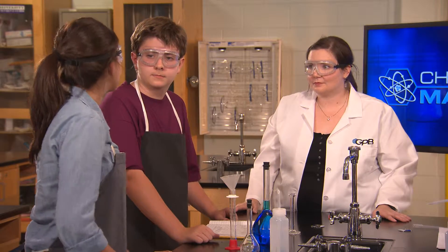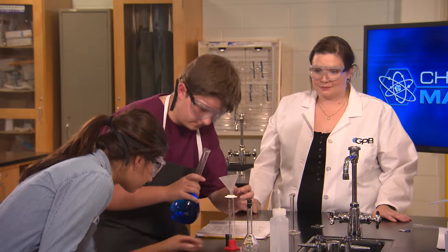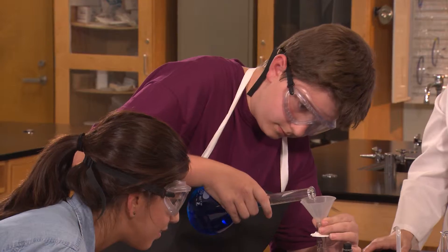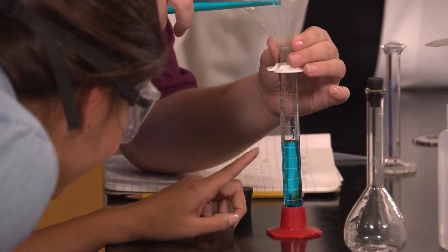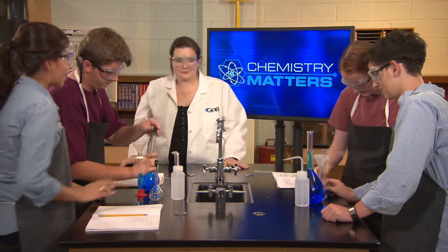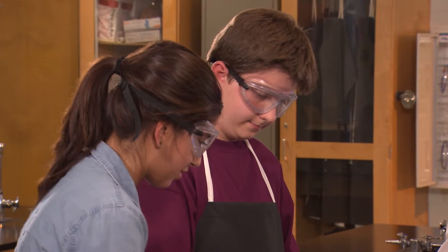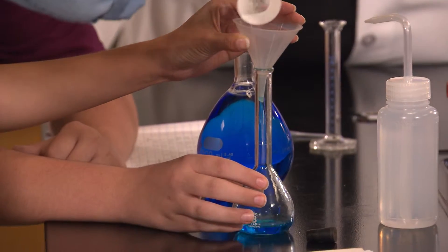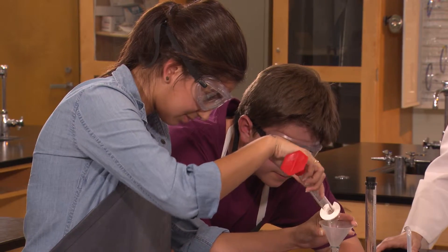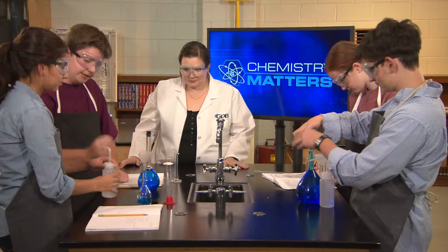Let's add the copper(II) nitrate solution to the 25 milliliter graduated cylinder. Be careful not to overshoot it—let's put about 16 milliliters in. Once we have the right amount, we'll pour it into the 100 milliliter volumetric flask. Now let's add the distilled water to the flask. We have to make sure we fill it exactly to the line, so be careful.